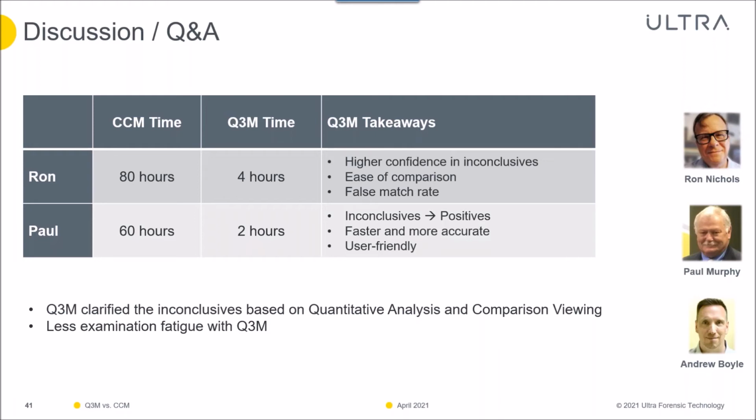But when I was looking at the quantum 3D microscope, it was just so much easier because, again, I could adjust that lighting within seconds, and I could be assured that it would be the same on both sides. I could adjust the coloring if I wanted to, the depth. And so the comparison was just a lot easier.